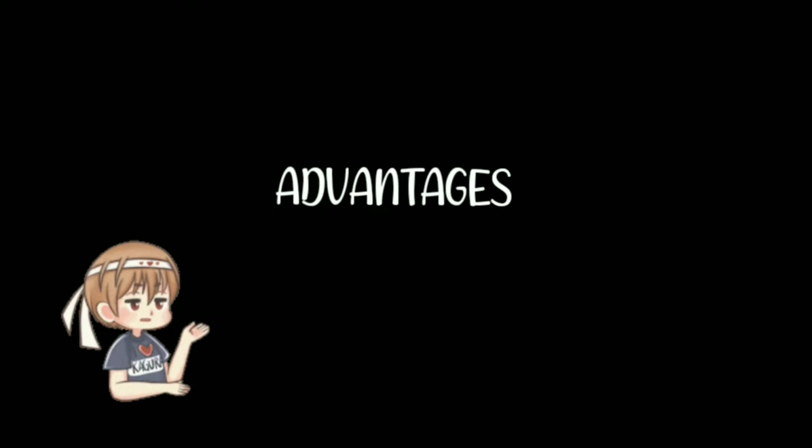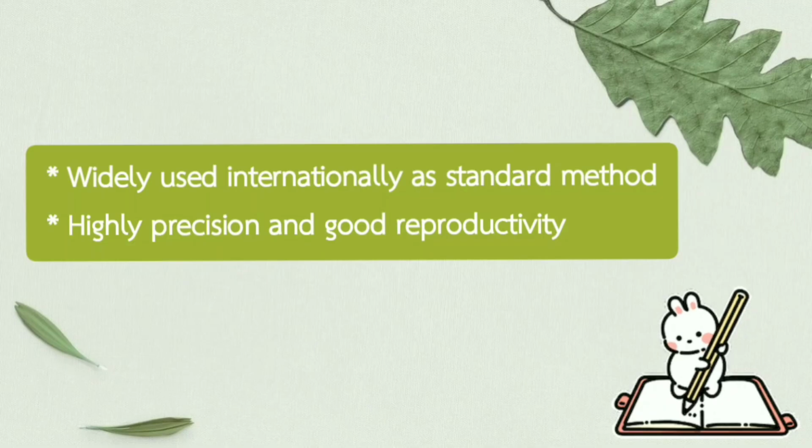Next topic, advantages of Kjeldahl method. First one, it is widely used internationally as a standard method. Second one, it has high precision and good reproducibility. Please forgive my spelling mistake. I had written highly instead of high in the note.